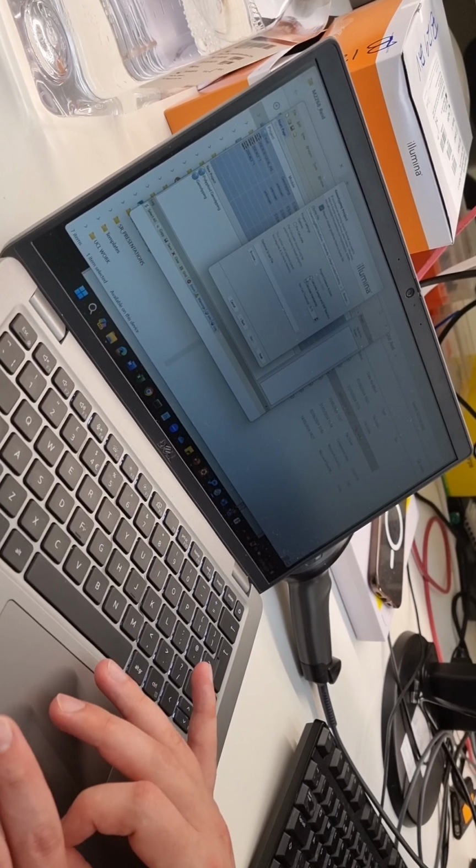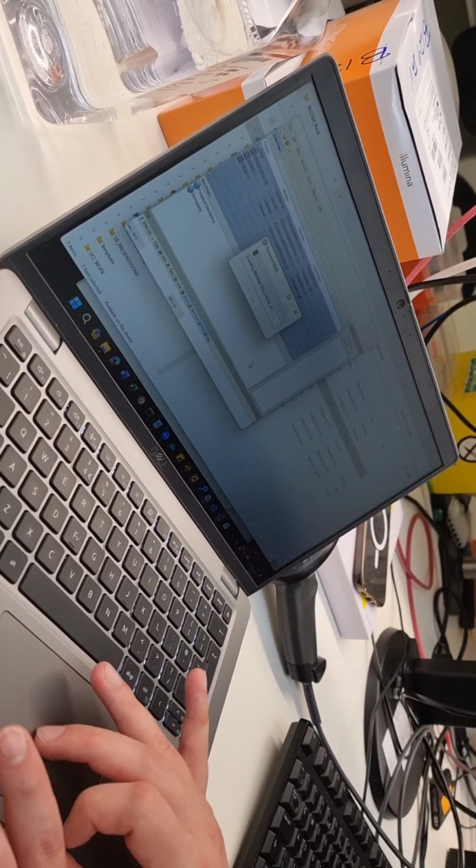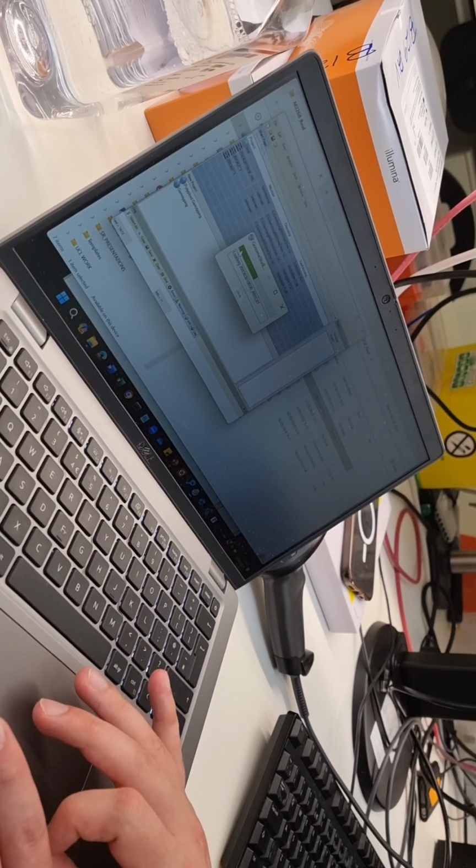Then you need to go for calculate sample and SNP statistics. Select that, and then finish. And then you want it to stay there for a few seconds. If it just immediately goes green, it means there's an error, but that's just loading up now. While that's loading, I'm just quickly going to get my samples for one second.